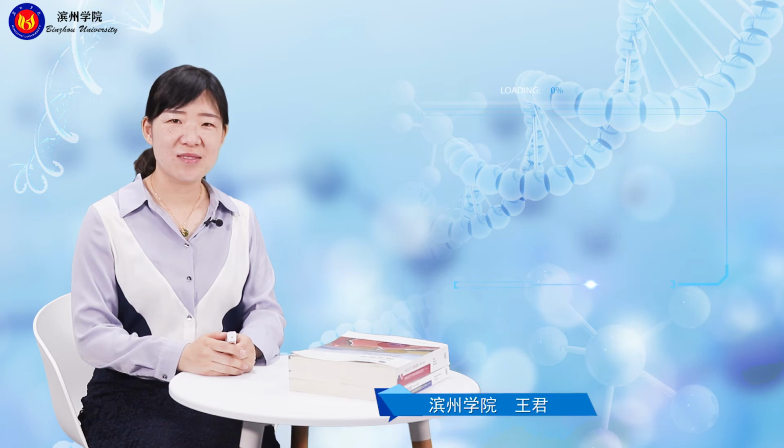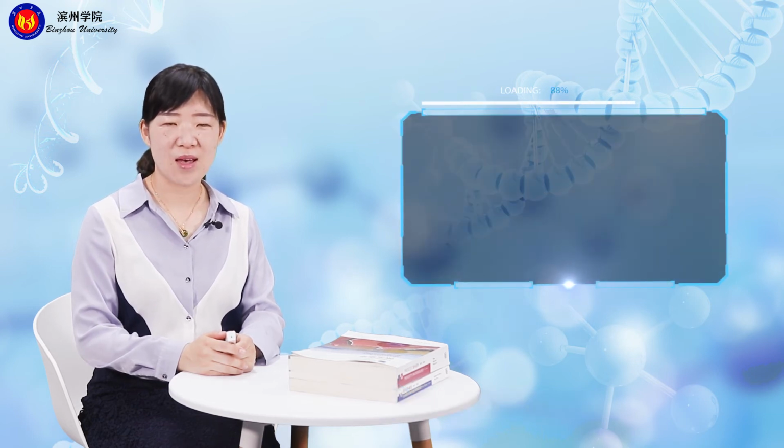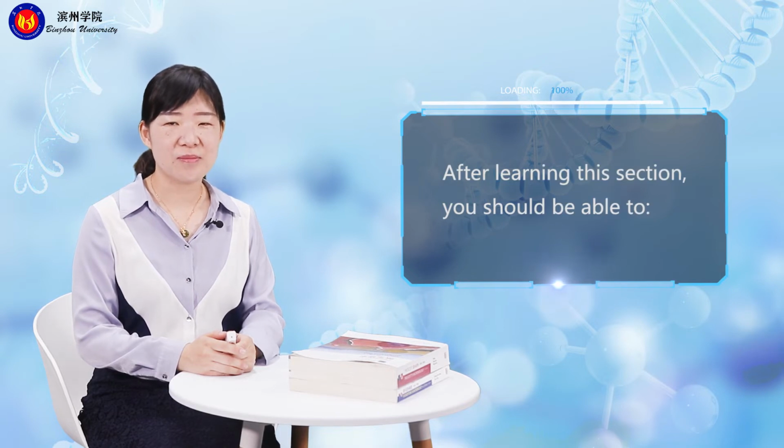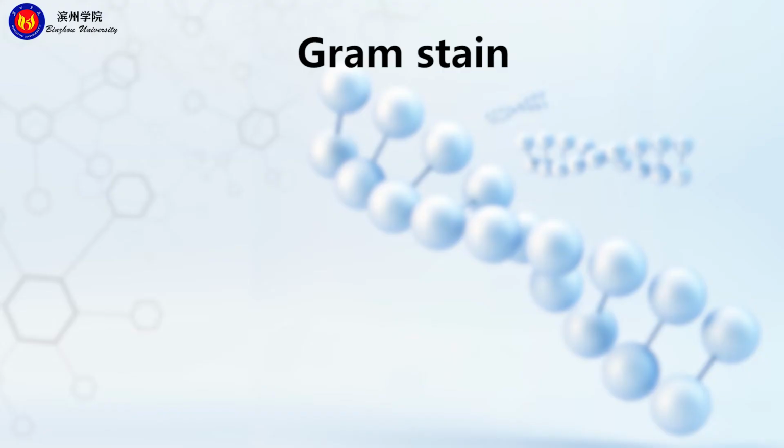Hello everyone, this section is for Gram-Stain. After learning this section, you should be able to relate bacterial cell wall structure to the Gram-staining reaction. Gram-Stain.